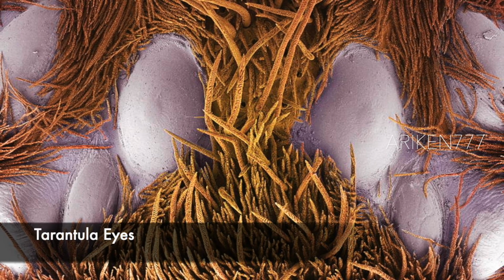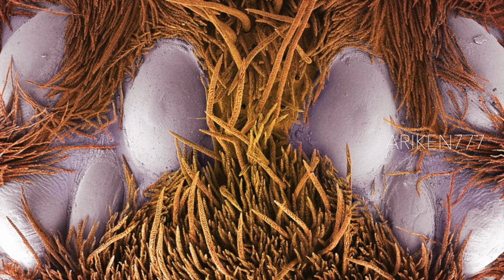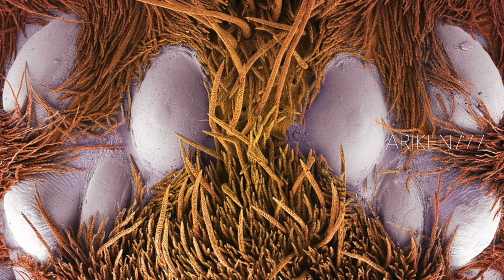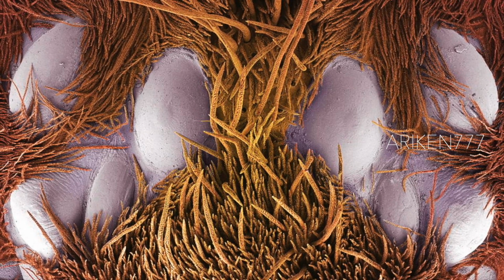The 8 eyes on the head of a Mexican red-kneed tarantula. This tarantula does not have very good vision, mostly relying on its sensitivity to noise and vibrations detected with its leg hairs. The eyes are located on a raised bump on the head.